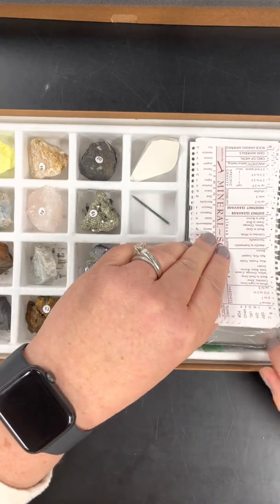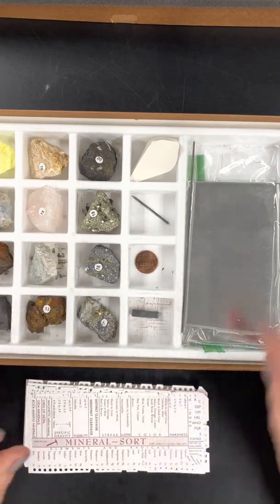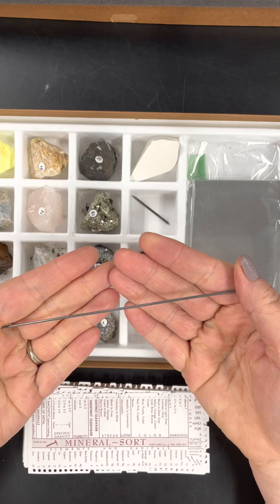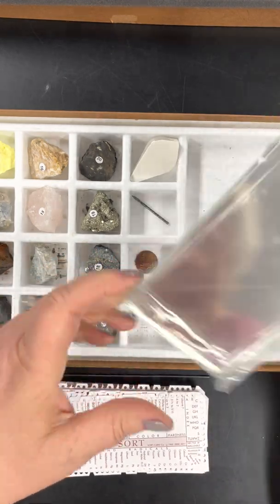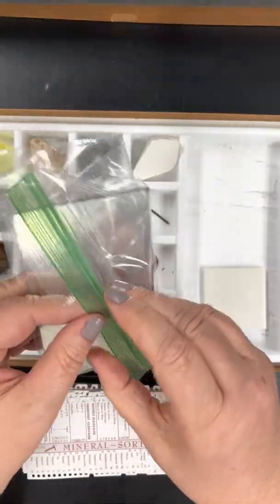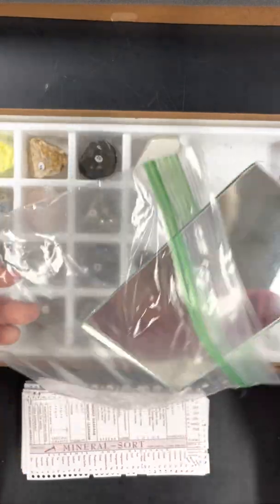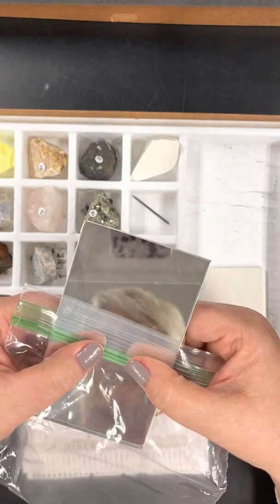We've got these cards, and I'll talk to you guys about the cards in a minute. I'm going to move them off to the side. I have this long tool here that we need to use in conjunction with the cards. And I have a mirror. Now, I've got the mirror in a plastic baggie because I don't want anybody to cut themselves. We're going to use this as a way to scratch it to find out about the hardness.